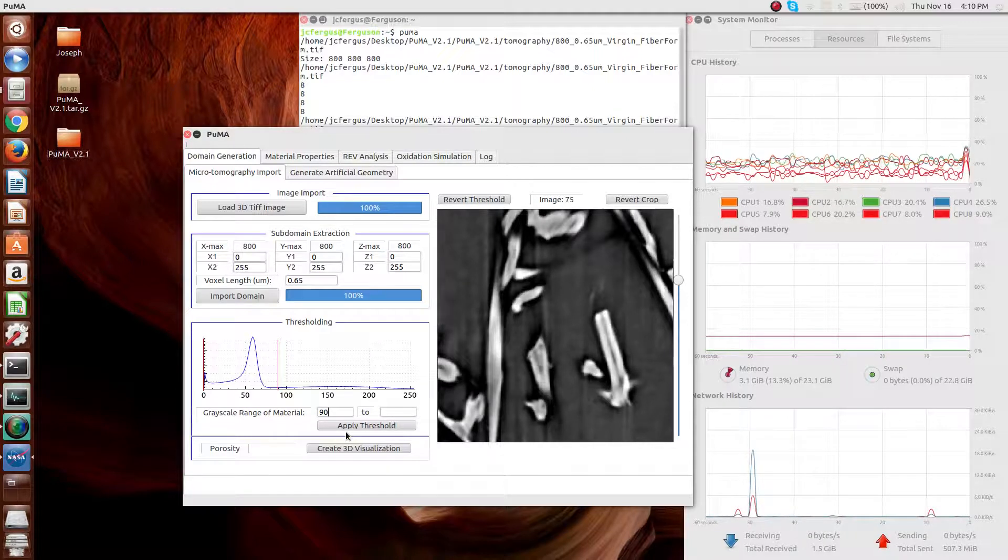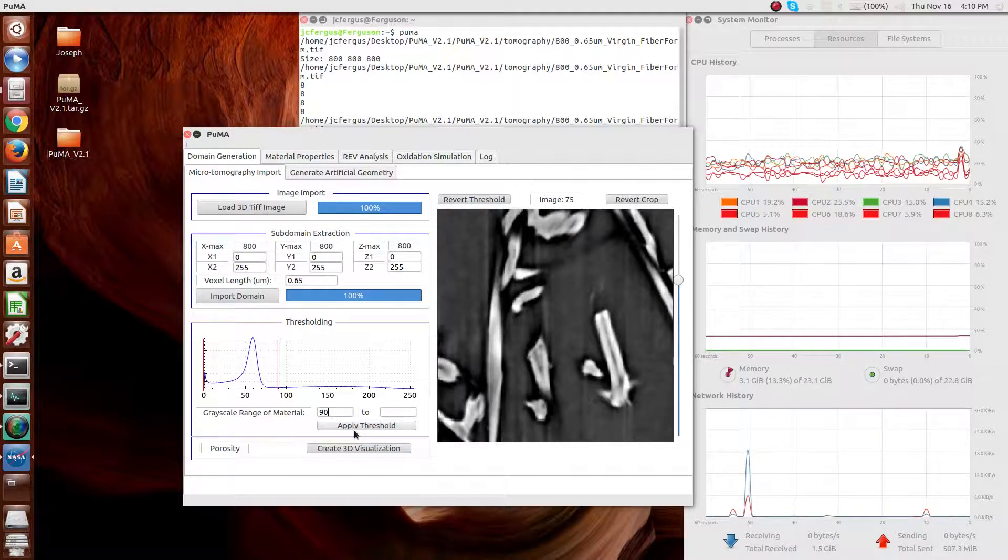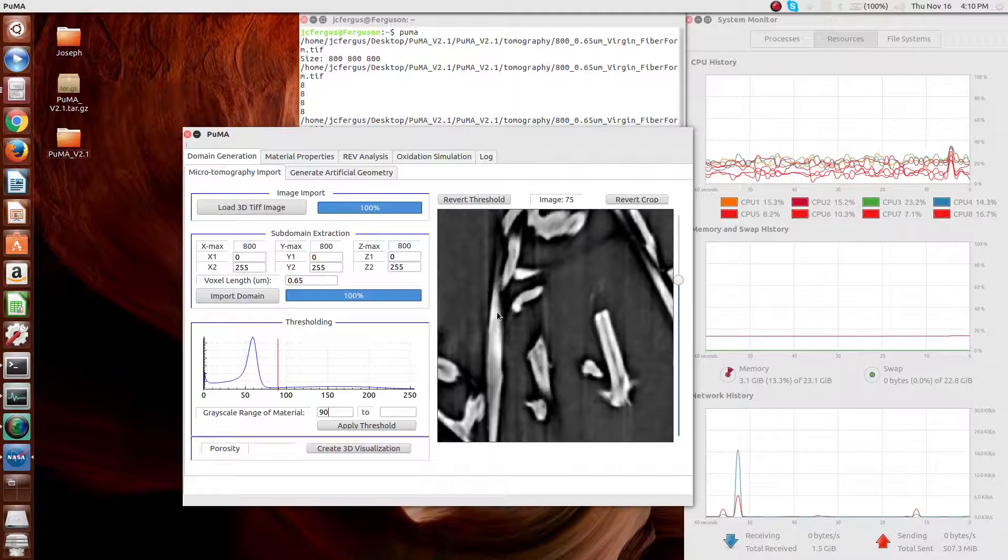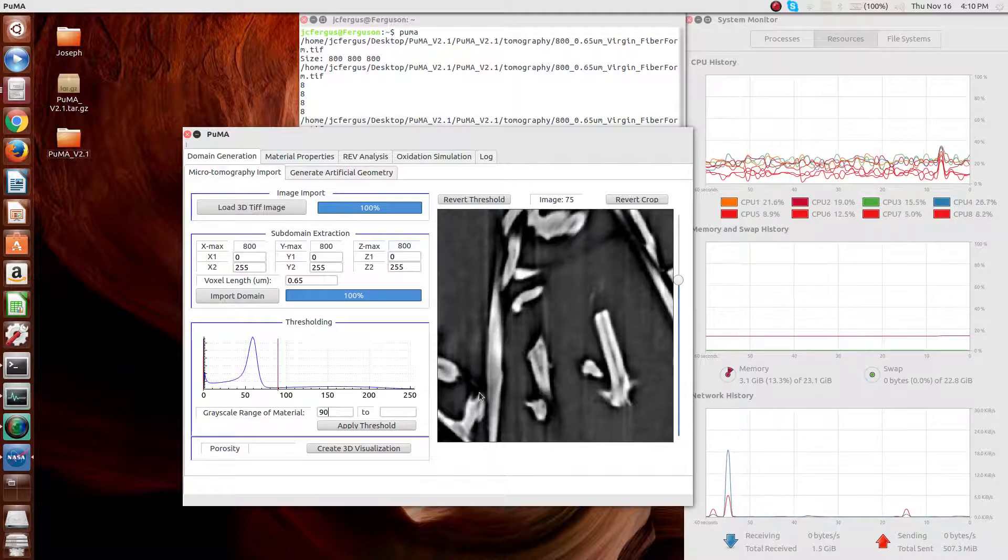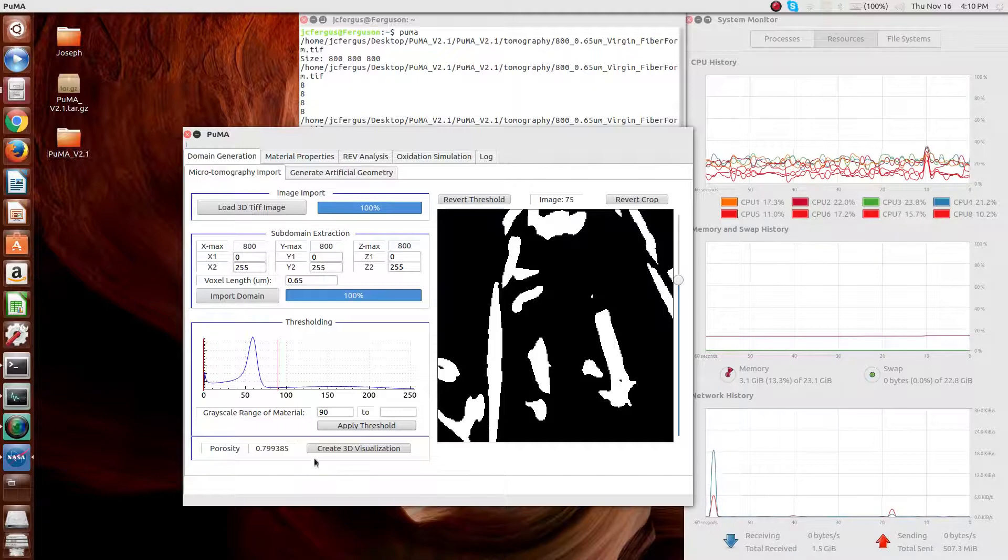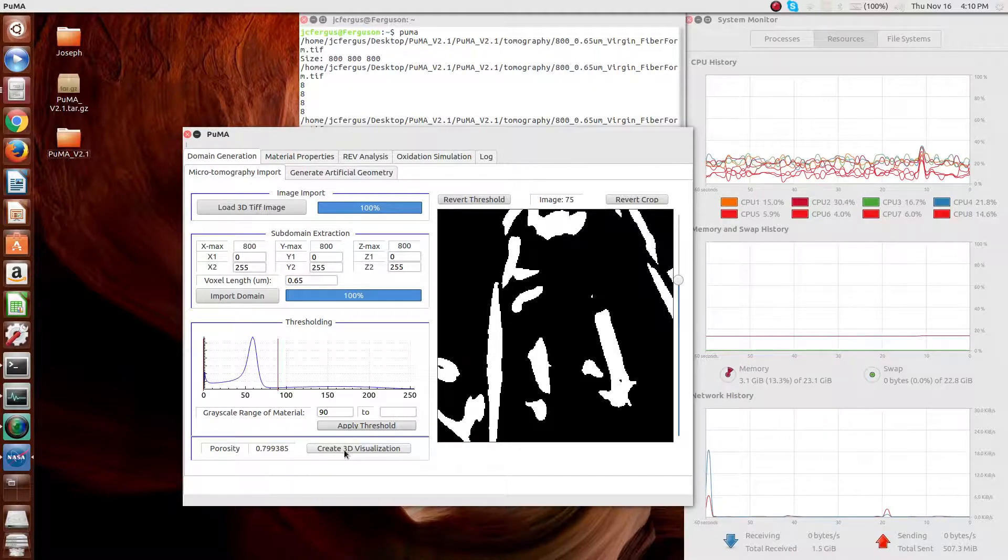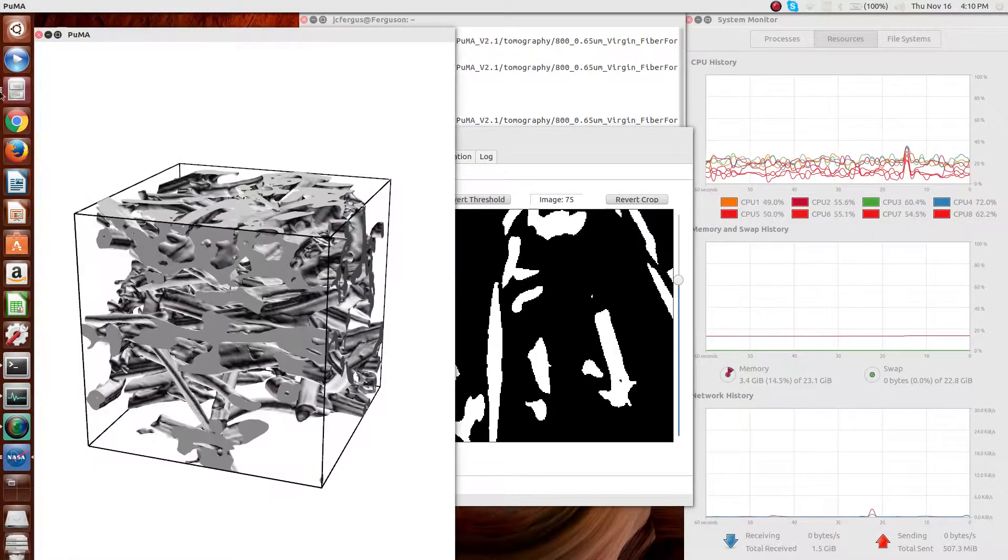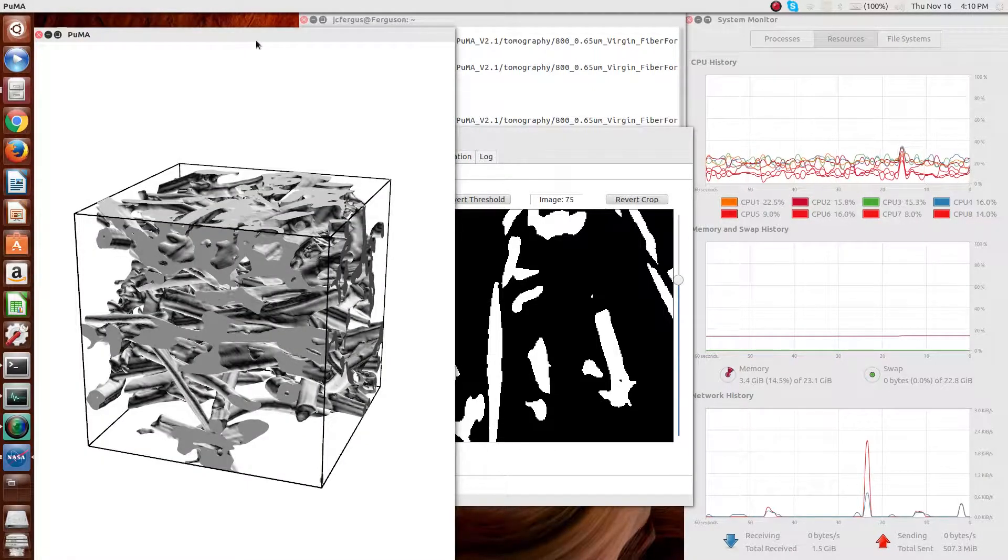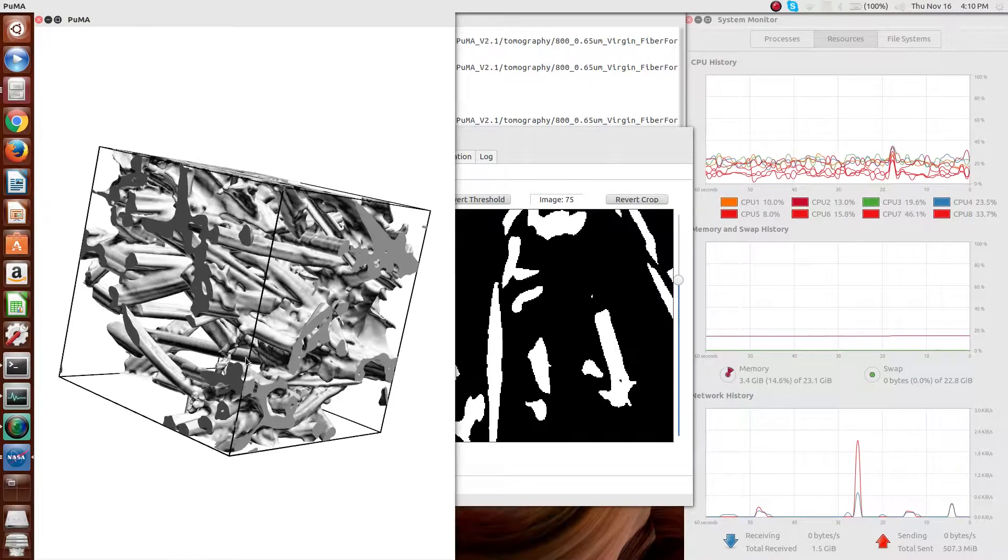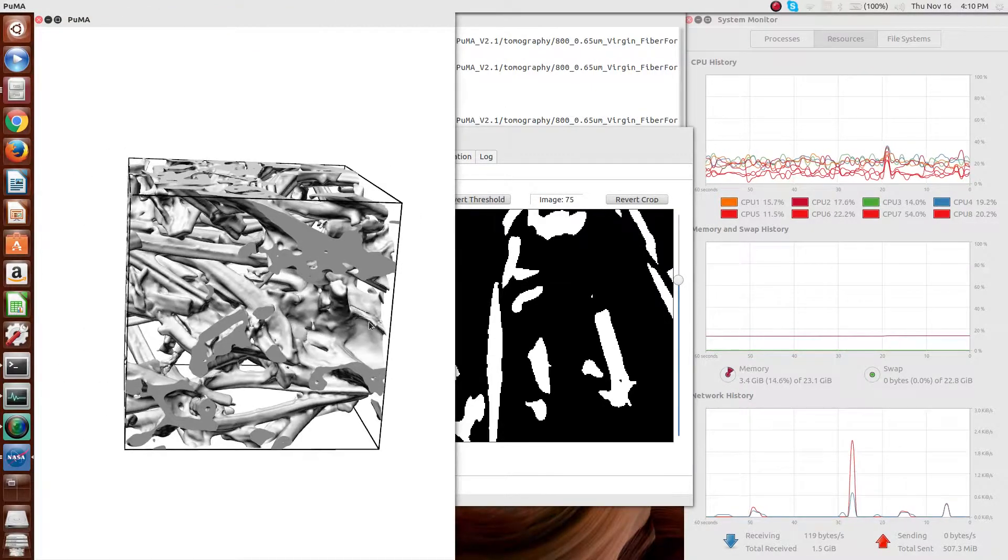The next step is the thresholding method, where in this case it's thresholded into the difference between fibers, shown here as the lighter color, and void, shown as the darker color. After the thresholding, the image can be visualized, and you can see the basic carbon fiber structure.